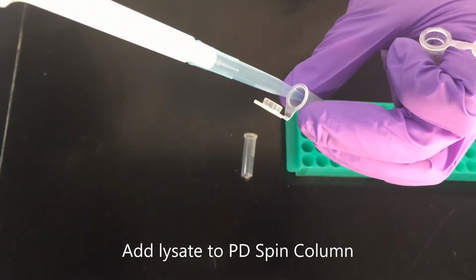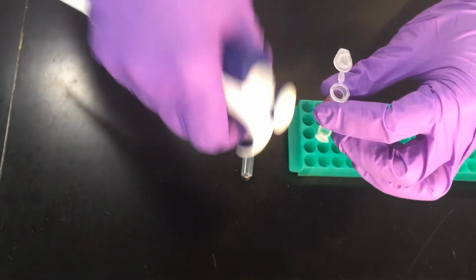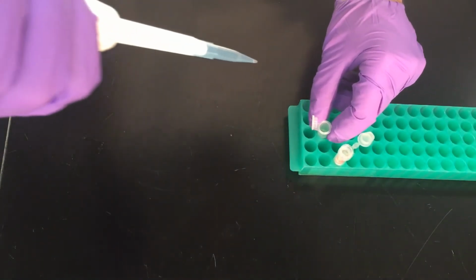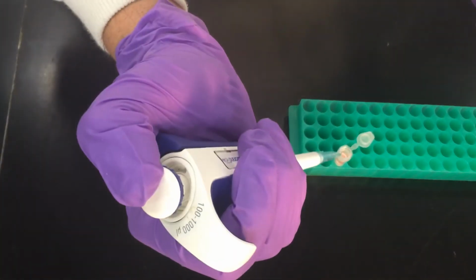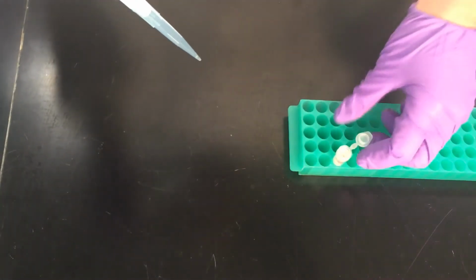So very carefully I'm going to get that liquid out, and none of the precipitate is going to be added to this column here. It may take me a couple of rounds of pipetting. This is also going to go in a collection tube, by the way. That's going to collect any liquid that goes through. Very carefully. Like I said, I don't want to get any of the precipitate. The precipitate is going to have contaminating proteins and genomic DNA. These are things that we do not want. So that's done. So this here now is waste. I'm going to throw that out. I'm going to keep this.